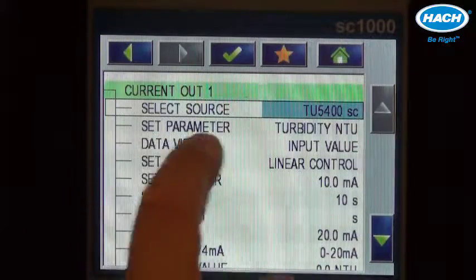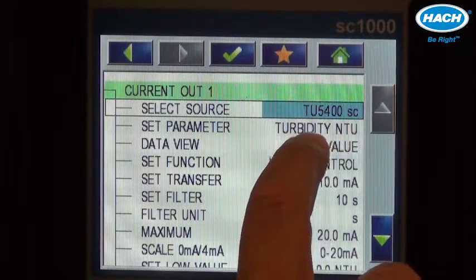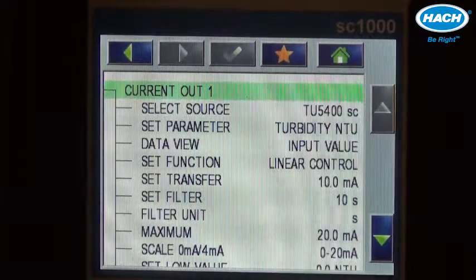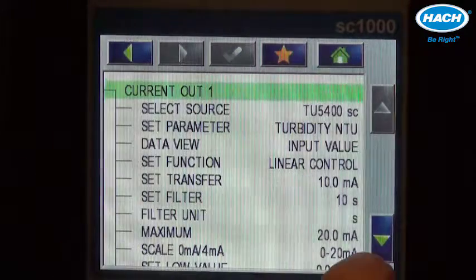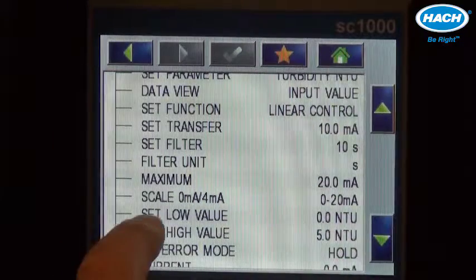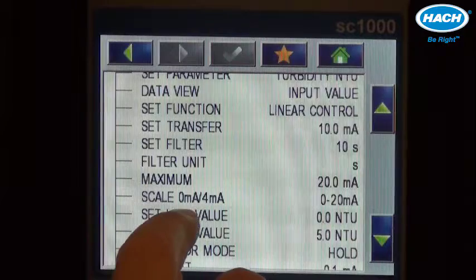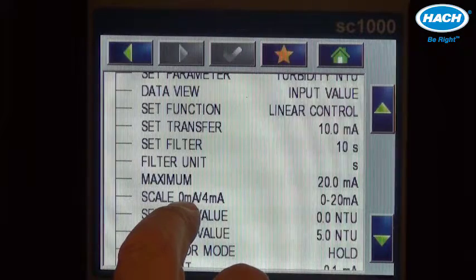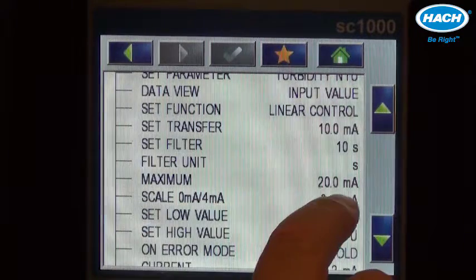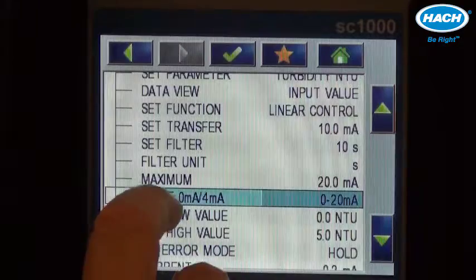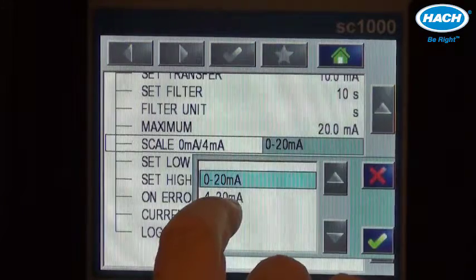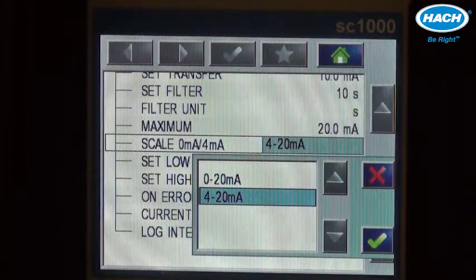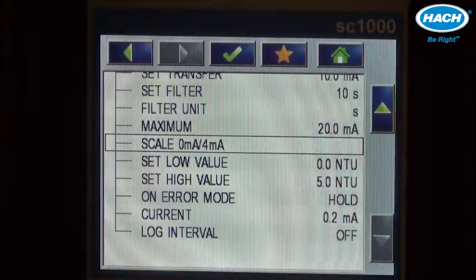Notice the parameter that we're going to monitor is turbidity and NTU. And if we scroll down, our scale can either be between 0 or 4 and 20 milliamps. So we'll change that to 4 to 20 milliamp, which is typical.